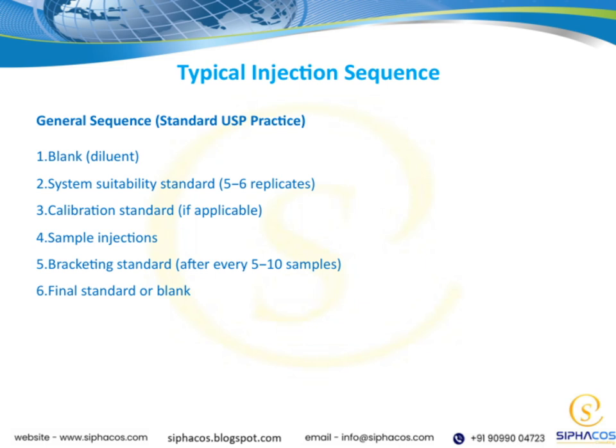This last step confirms that the system has remained clean and stable throughout the analysis. So that's the typical injection sequence. It's designed to ensure reliable, reproducible results while monitoring system performance throughout the process.